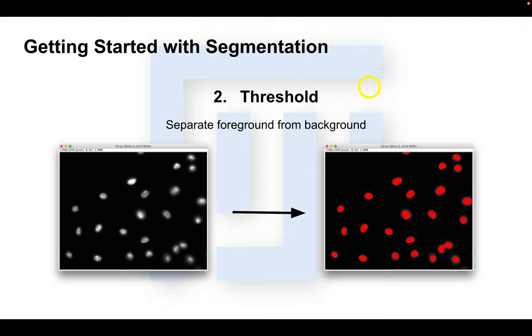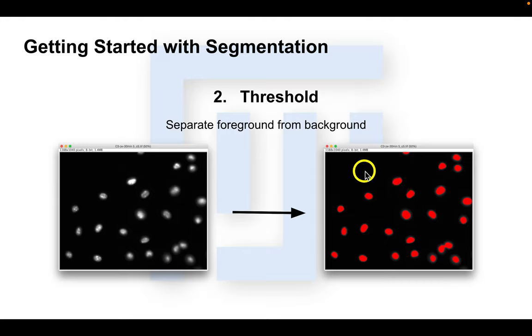For example, choosing cells versus background. Thresholding an image is essentially choosing a cutoff value, delineating your objects from your non-objects, or your background.